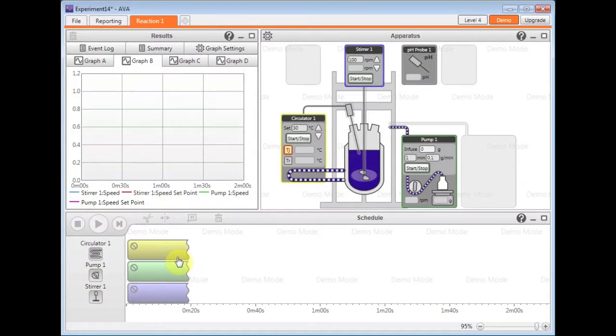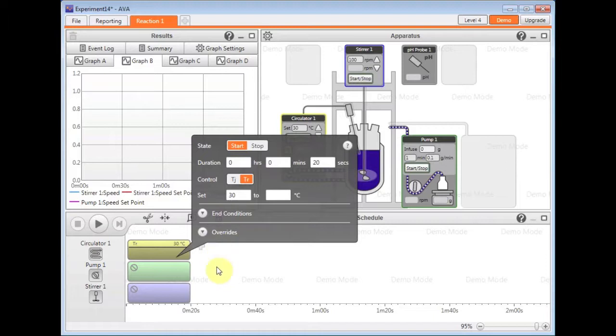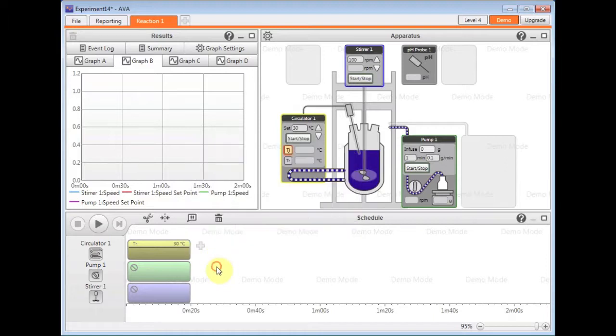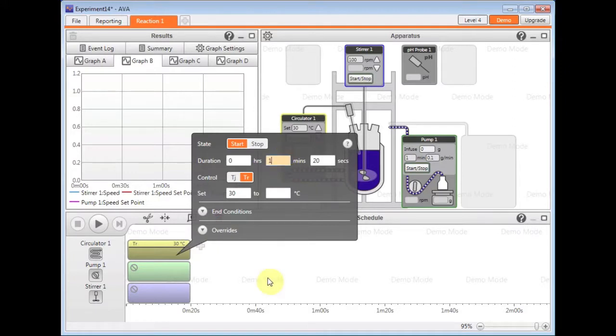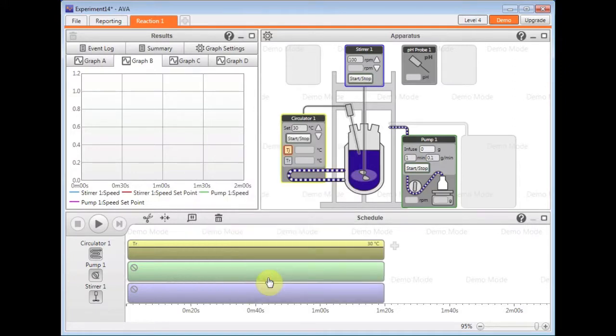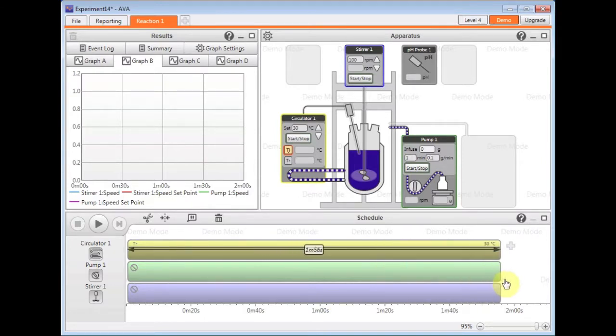Click back on any row of the schedule to activate schedule control again. And now I can change these steps by either clicking on them, changing the duration fields, click off to apply, or I can actually drag the box itself to change the duration for that step.